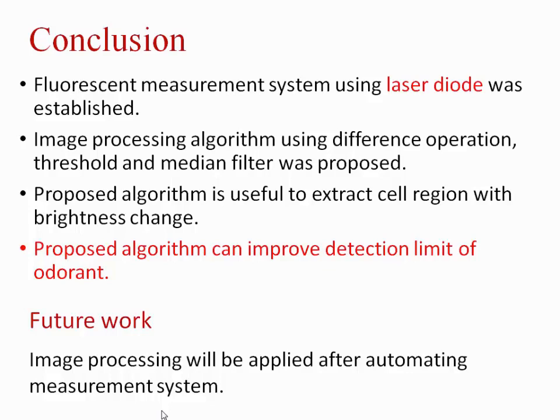And future work is that image processing will be applied after the automatic measurement system. Now we are developing the automatic measurement system, and we will combine these two, and so obtain much data using this kind of image processing and automatic measurement system.